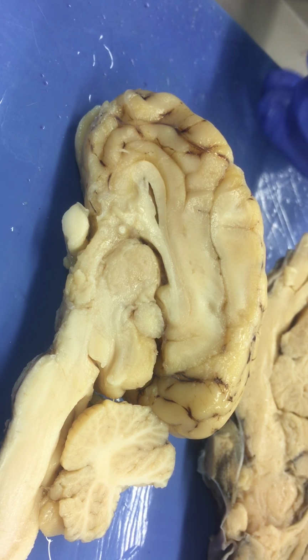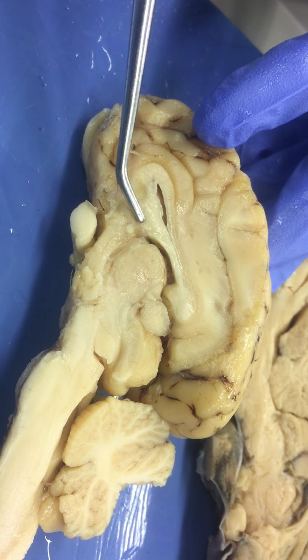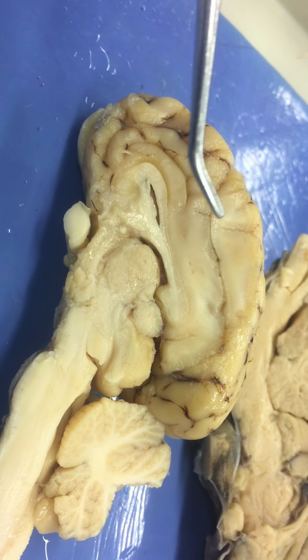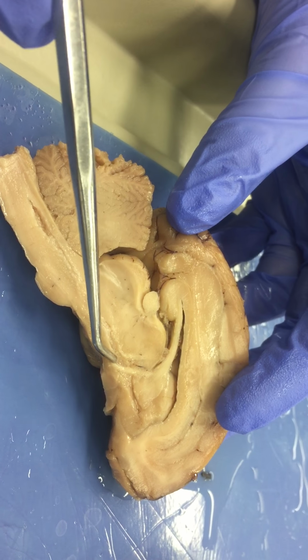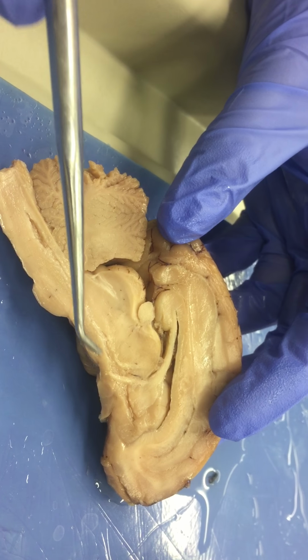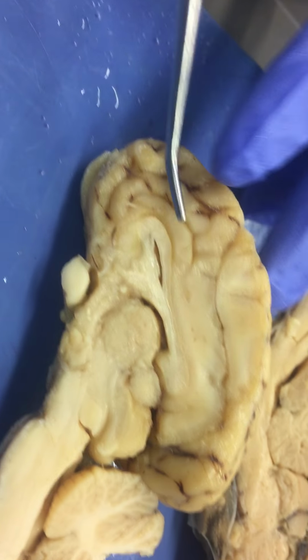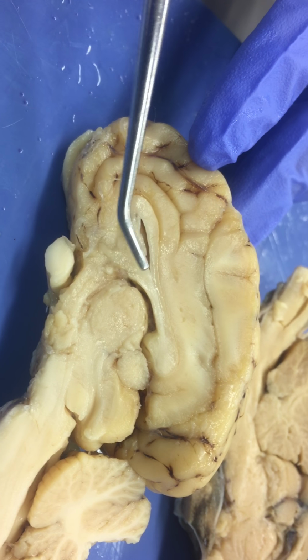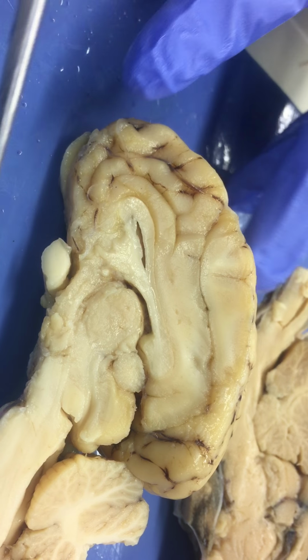Okay, the postcommissural fornix is a tract from the fornix. It's going to run from the fornix down into the mammillary bodies. It's really hard to see on these. You can see it a little bit better on this one, how it runs down here to where the mammillary bodies would be. Okay, then we also have our precommissural fornix, which is going to be running into this area, which is the septal region. So it's going to come down from the fornix into the septal region, and that was the precommissural fornix.